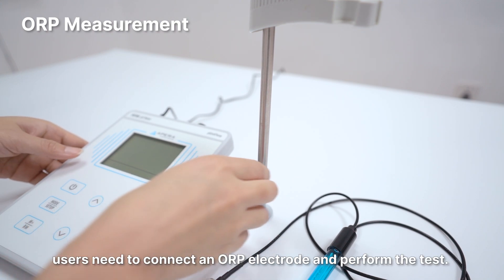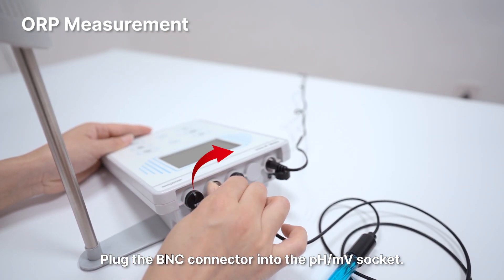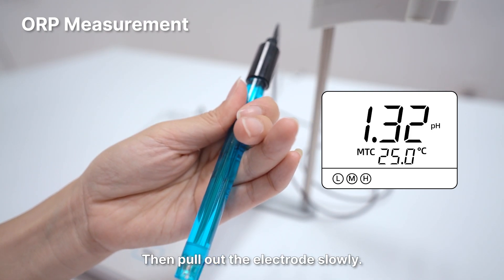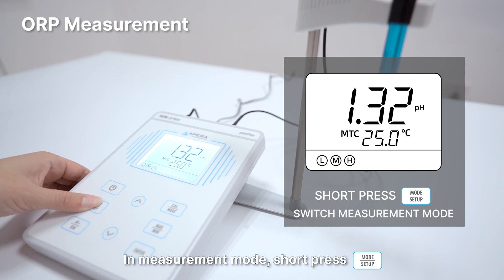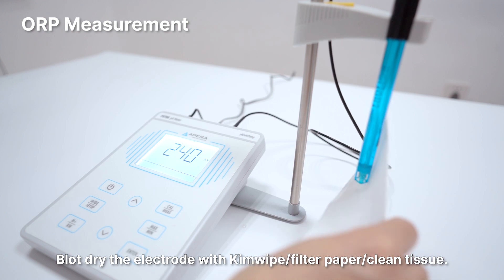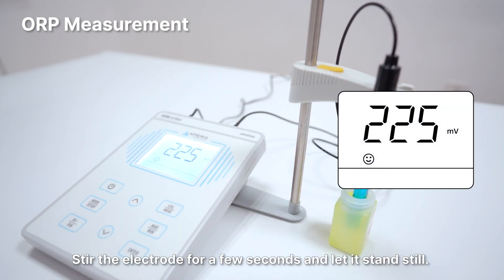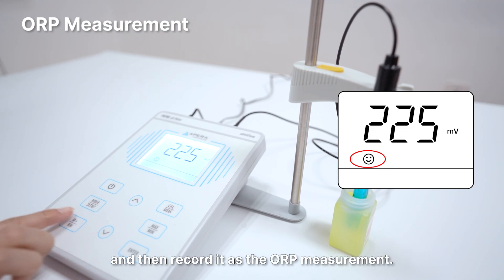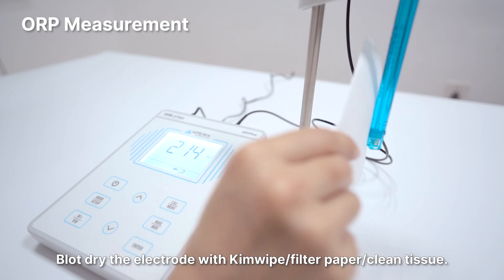If ORP measurement is needed, users need to connect an ORP electrode and perform the test. Plug the BNC connector into the pH or MV socket. Loosen the locking ring of the electrode storage veil by twisting it counterclockwise, then pull out the electrode slowly. Power on the meter to enter measurement mode. In measurement mode, short press the Mode button to switch between pH and MV measurement mode. Rinse the electrode with pure water for a few seconds and blot dry with kimwipe, filter paper, or clean tissue. Submerge the electrode into your sample solution at least 1 inch deep, stir for a few seconds and let it stand still. Wait for the reading to get fully stabilized and then record it as the ORP measurement. Rinse the electrode with pure water and blot dry.